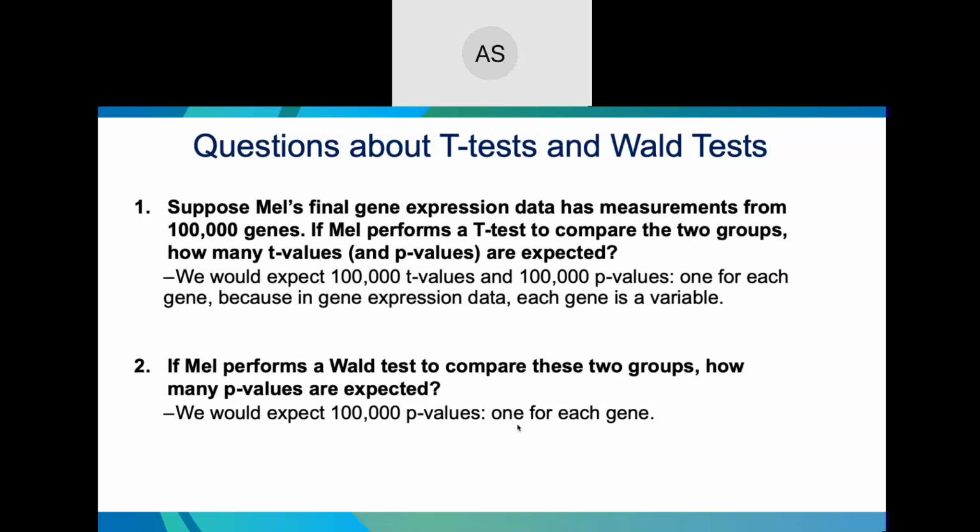But depending on the type of question you're asking, you may want more specific and more mathematically flexible results, and so you want to use something like the Wald test. Does that make sense? Awesome. And we will get more into the distribution stuff in a little bit. Oh, you're welcome.